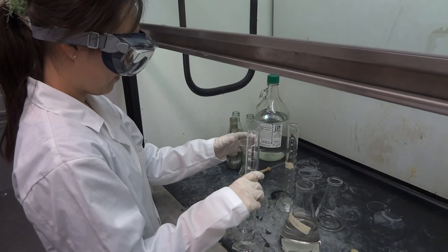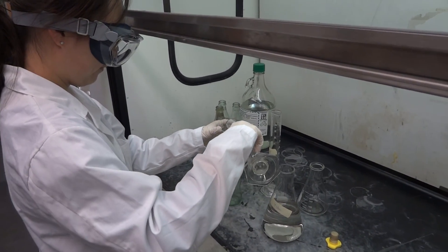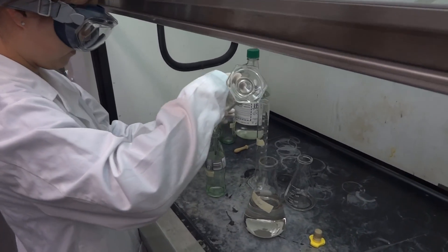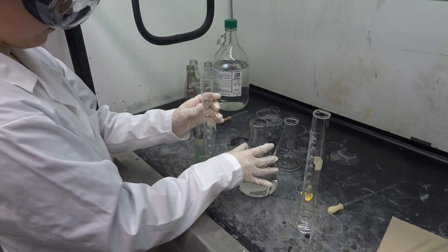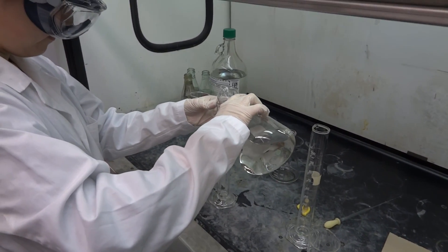So here we are. We're about to prepare a silver mirror. Eugenia is going to be adding 10 milliliters of concentrated glucose to our Diet Coke bottle, and then she is going to be adding 50 milliliters of Tollens reagent, which we freshly prepared.